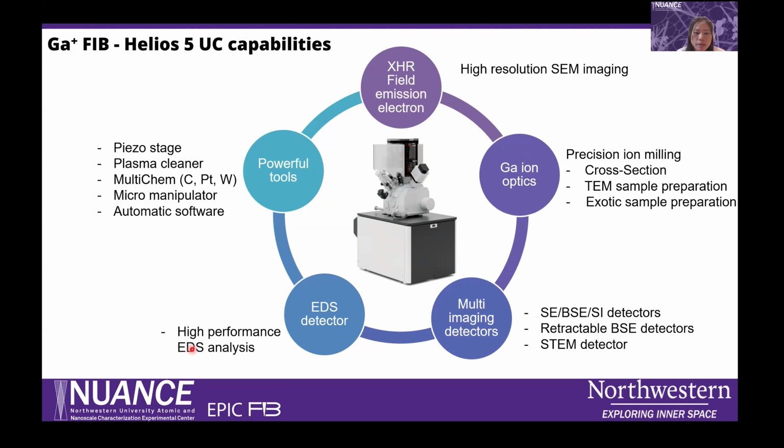Another is the analytical detector, EDS. For this instrument, we don't have EBSD. And there are several other accessories, which are very powerful.